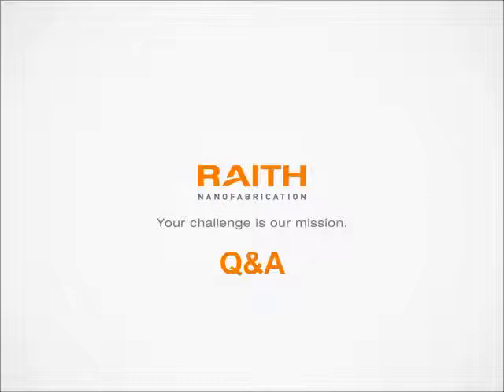Next question. With the high precision stage and a calibrated image, what sort of overlap requirement would you have to consider? Okay, so a few slides prior, we showed quite a large overlap of about 1 micron, but that's completely overkill, if you will. A typical overlap that we start with is, let's say, 100 nanometers, and if we need any more or less overlap, it depends on the overall imaging conditions.